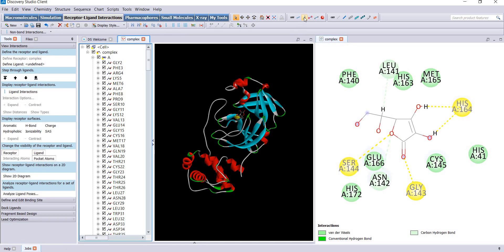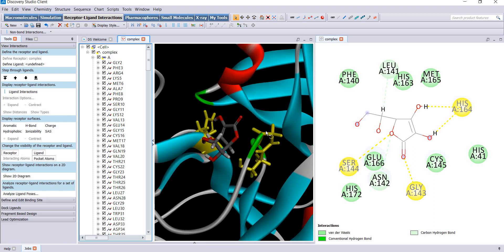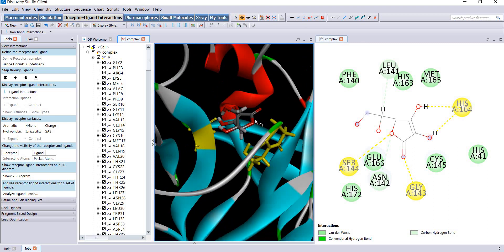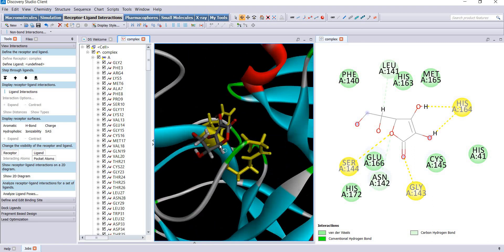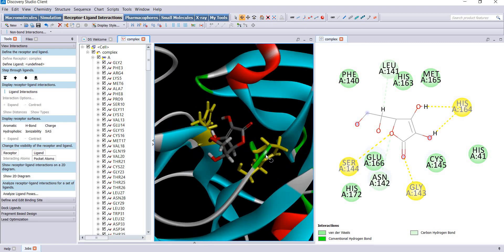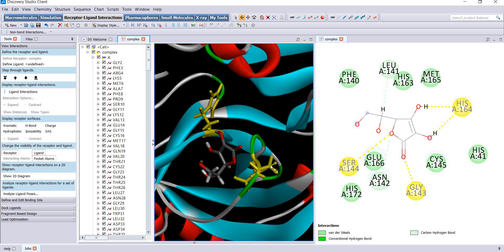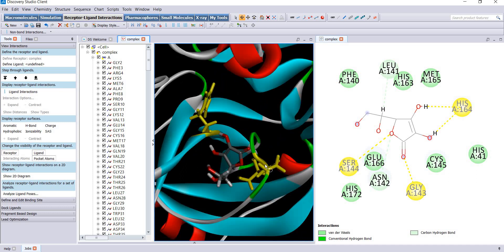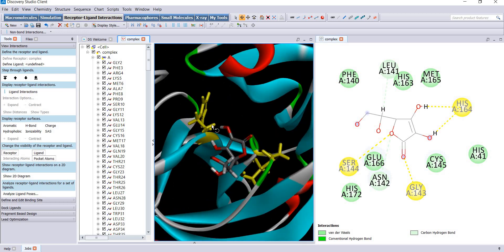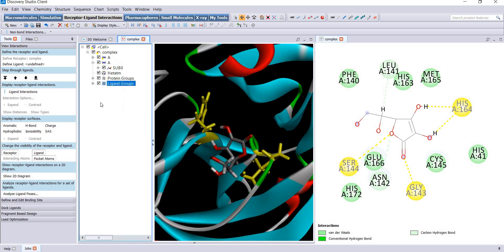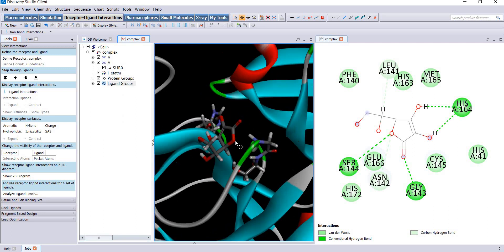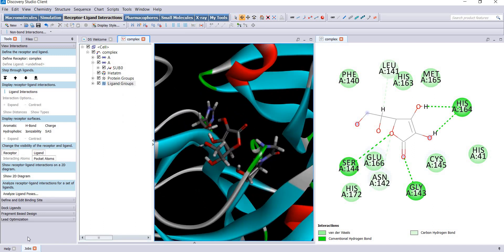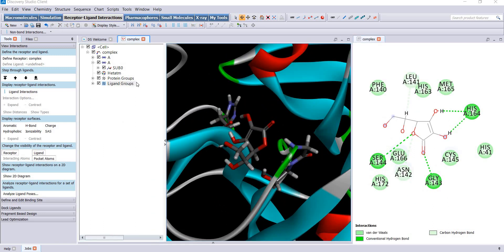Bring this into center and you can see this is our ligand and these are the hydrogen bond forming residues. Right now you are unable to see hydrogen bonds.